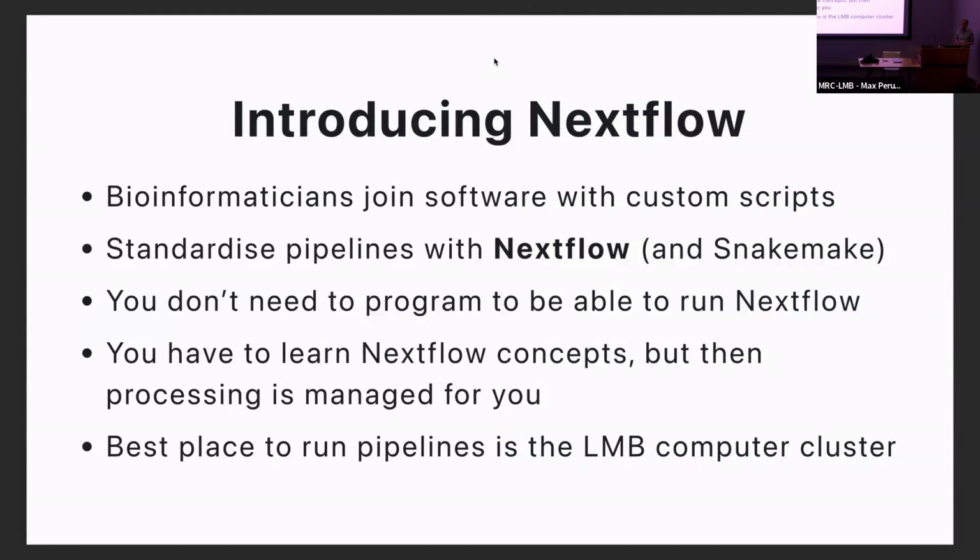These scripts were typically written in Python or Perl. But the problem is that these languages weren't geared specifically for handling data flow through pipelines. So the computer programmers developed a new coding language, in fact, that can handle running the execution of software on different types of computing platforms. And it also manages for you as an inbuilt property the data flow through the pipeline.